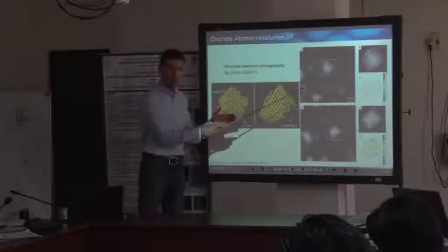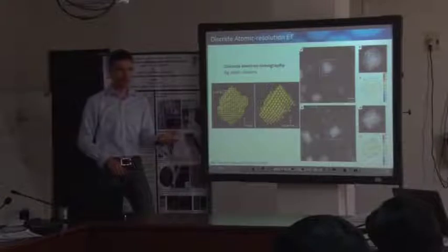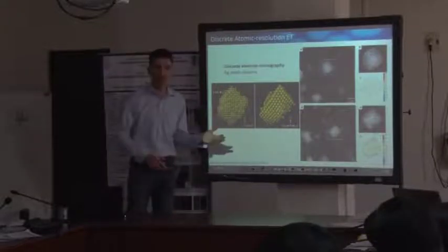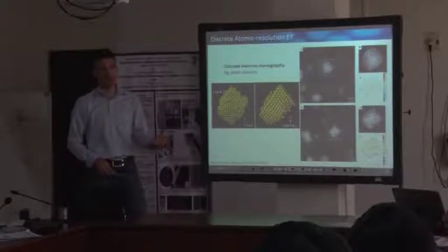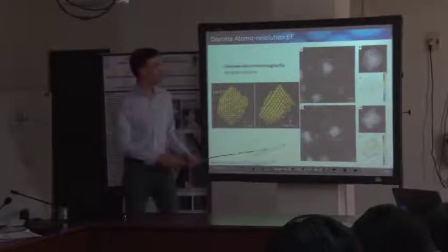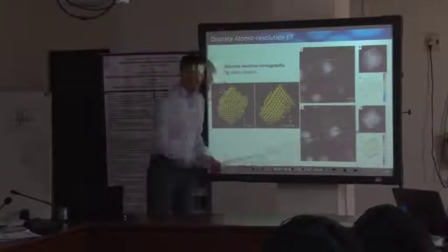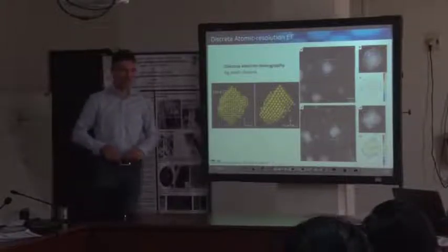To directly correlate the measured intensity with the number of atoms, because we know the scattering impact of an individual atom, we know the scattering impact of a certain number of atoms, and this can only be done by modeling, because you need to know how your intensity works with the local number of atoms. For these different directions, you locally know the number of atoms, and if you only have two projections, in principle, your 3D distribution of all your atoms is determined.